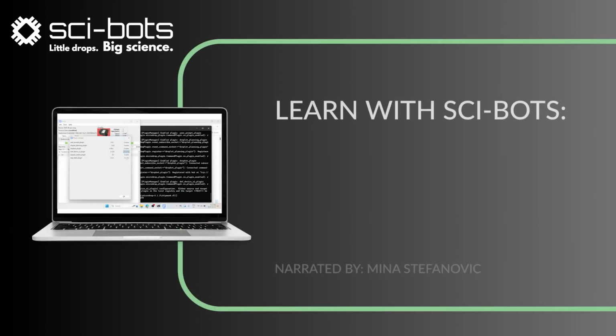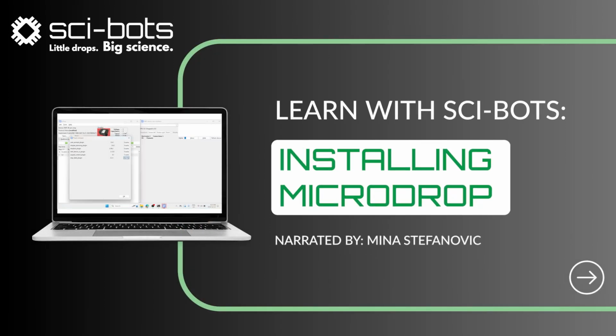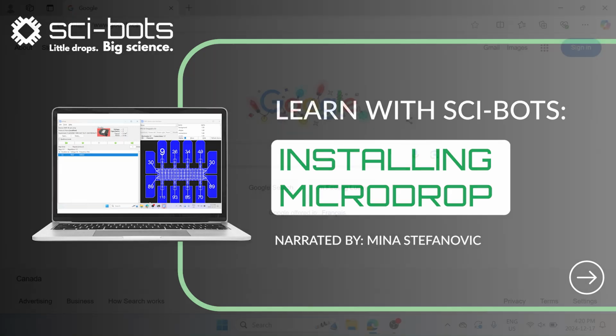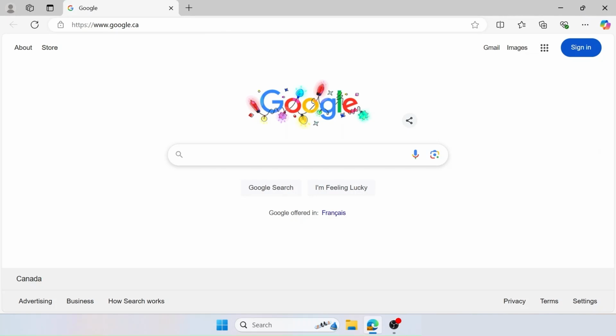This DropBot tutorial will guide you step by step through the process of installing the Microdrop software, the Windows application for programming and controlling your DropBot. Let's get started. First, you will need to download the Microdrop software.